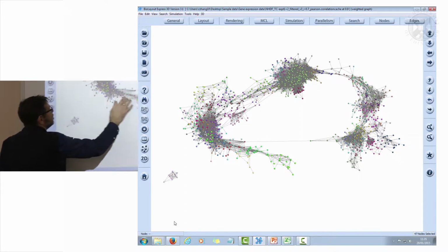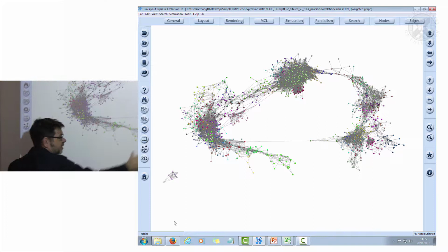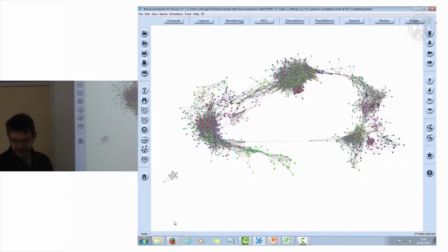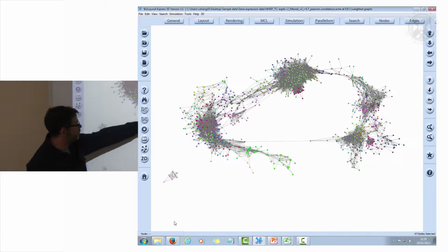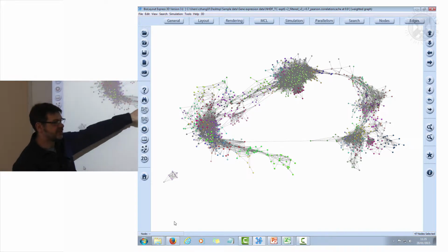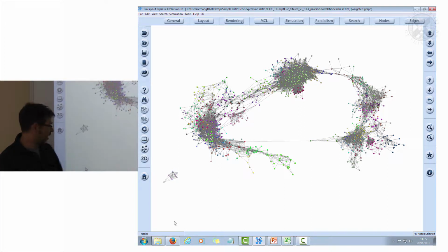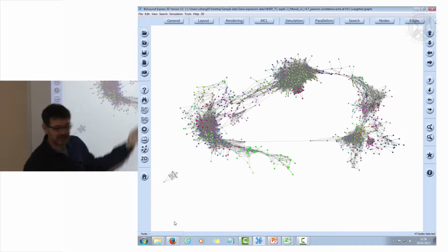So here, this continuum shows this here. There's a decrease and then a burst here. So actually understanding that structure is quite important. And with most time course data, when Claire gets to look at her data, she'll see a cigar shape of LPS response, and that will represent it from the early to the late.